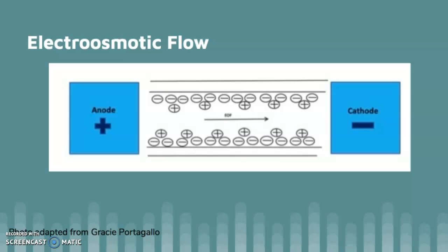An enzyme assay begins by loading the enzyme into the capillary electrophoretic system by electrokinetic injection. As soon as the enzyme is loaded, the reactants mix and the reaction can begin. Product formation is continuous until all of the enzyme exits the system. Therefore, this will continue to occur until all the enzyme is used up.